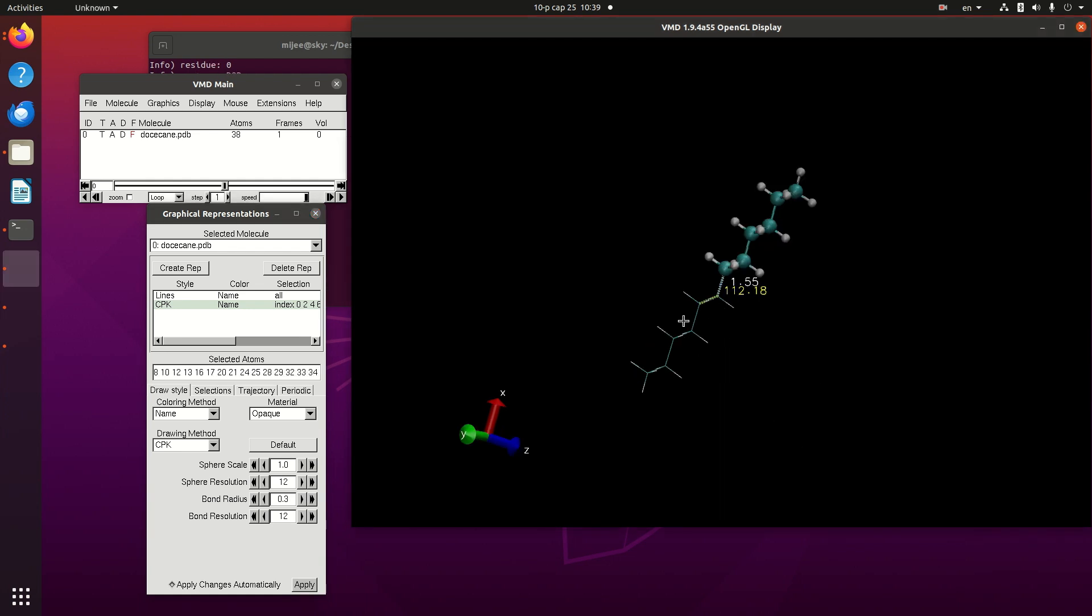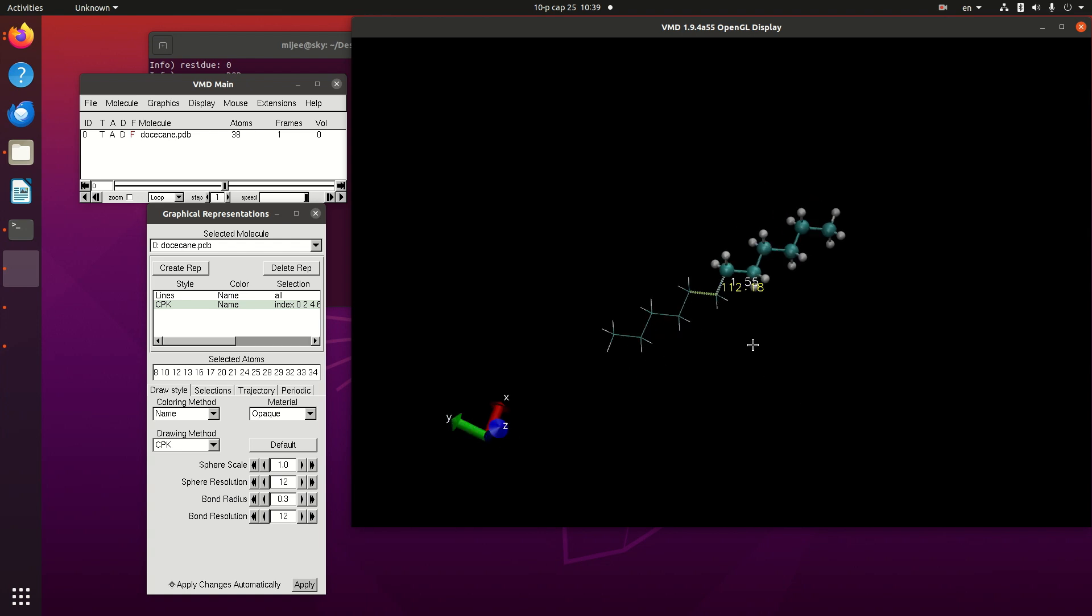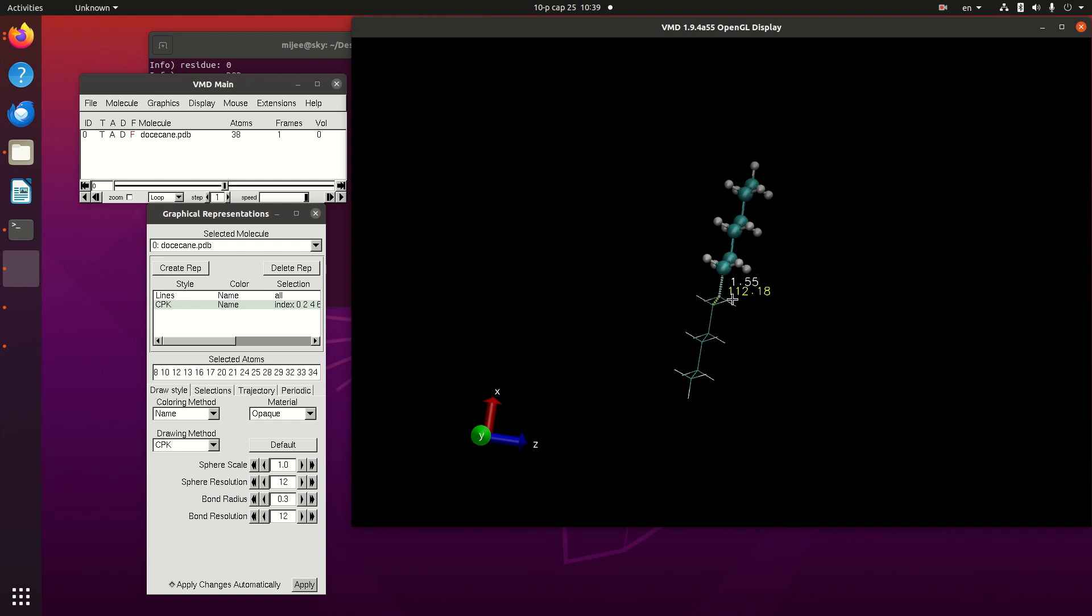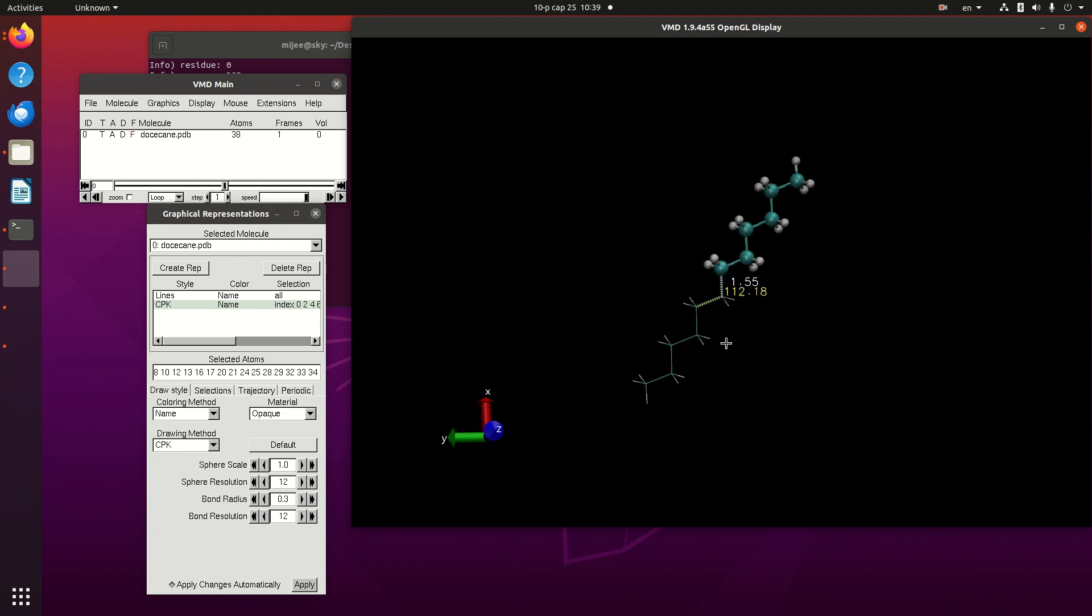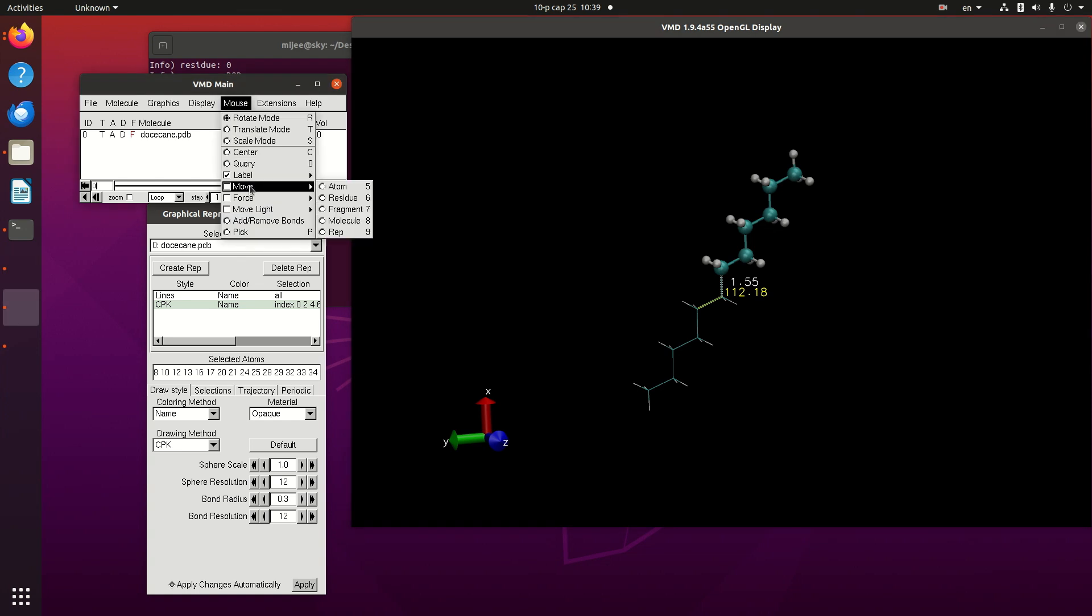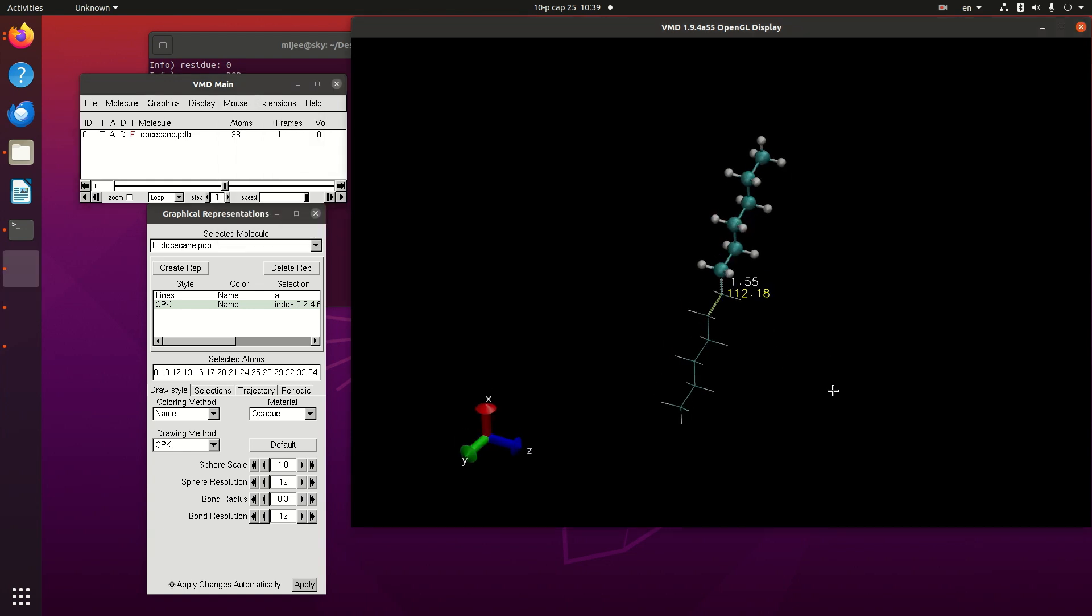Now, I would like to change this angle value from 112 to 116. In order to do this, I would like to change another side, one side that is representation. We can change, move the different representation.